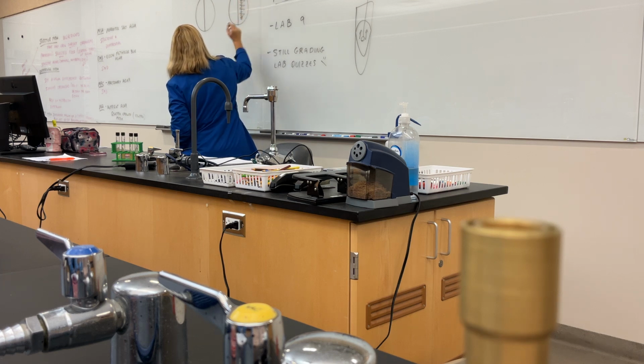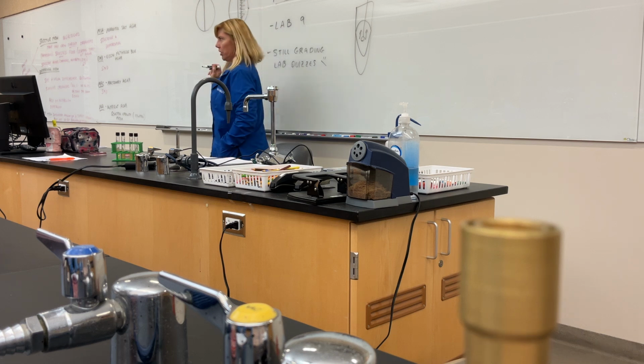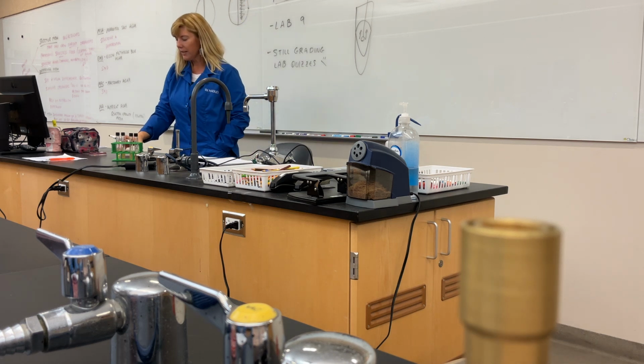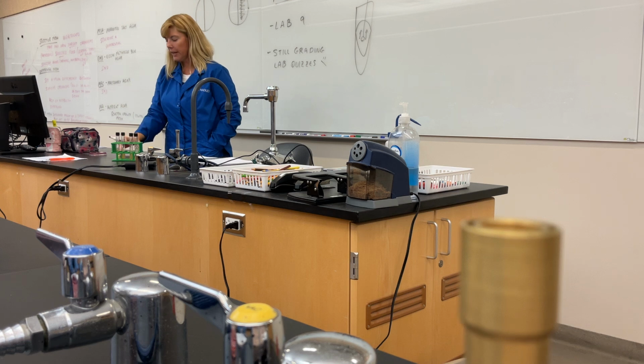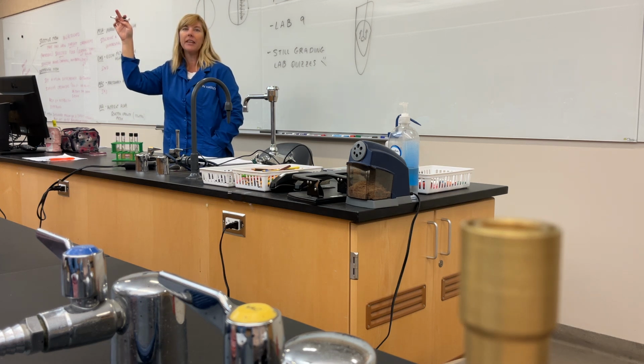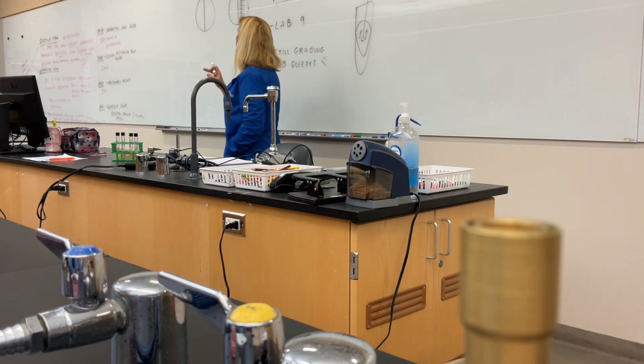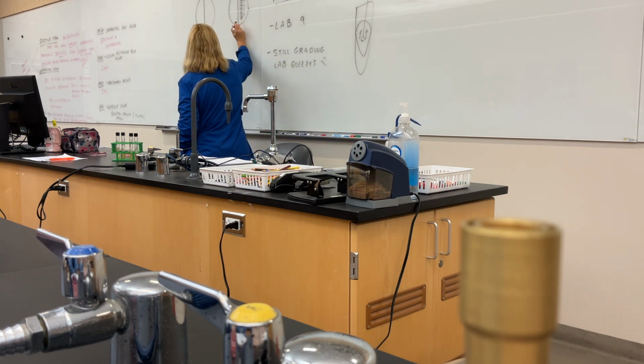But the one thing you want to be careful of, you do not want to go to the very edge. The reason for that is there's always a little moisture around the edge of the plate. If I get in that moisture, it's going to swing around the entire plate, and then it might possibly contaminate the surface next time and make it harder to tell my results. The other thing is I want to be careful to not cross over into the other section, because then I'm going to be affecting the neighboring bacteria.